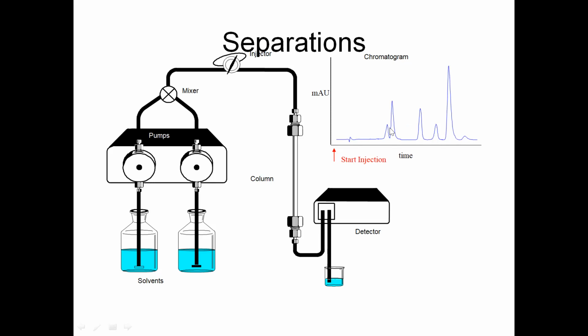So you got two pieces of information from here: quantitative and qualitative information. It tells you how many compounds are present. You can say that in this mixture 6 components are present, right? On the y-axis you see milli absorbance unit, MAU. MAU stands for milli absorbance unit.